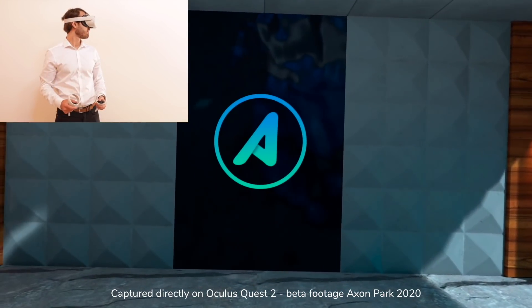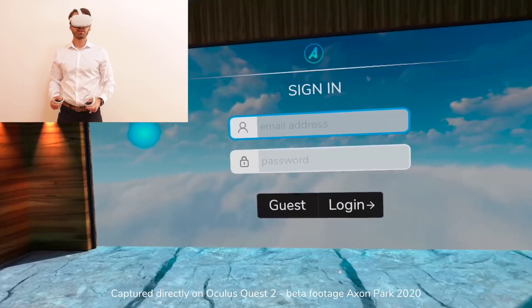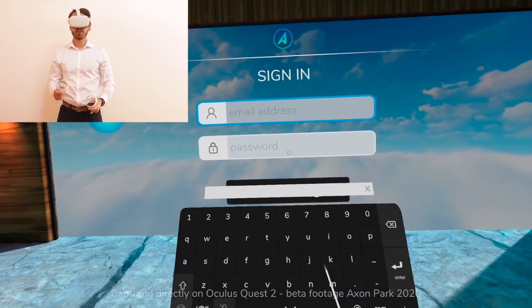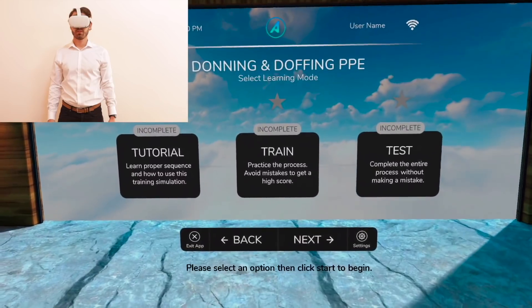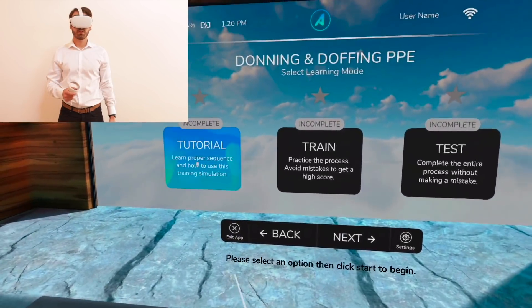Hi, I'm Axon, your new virtual tutor. Thank you for joining me today. To complete this course, you must successfully pass all three modes. Please select an option then click Start to begin.